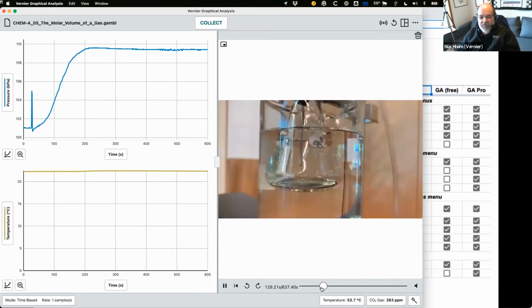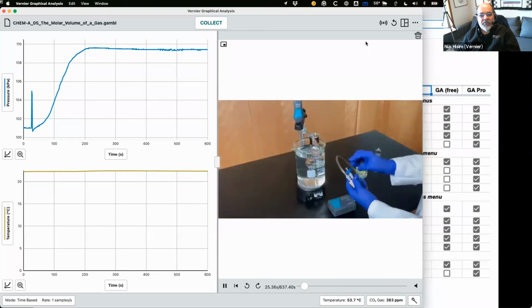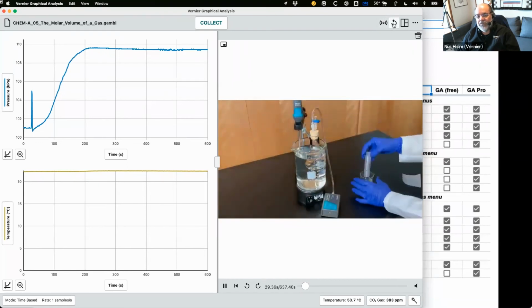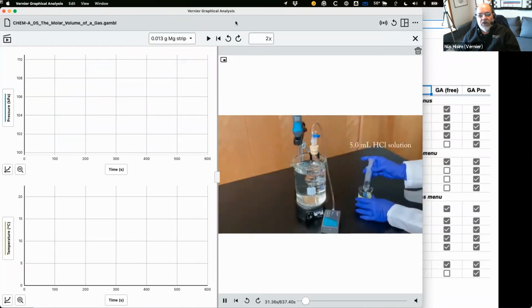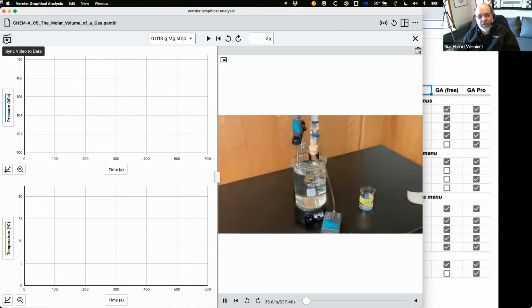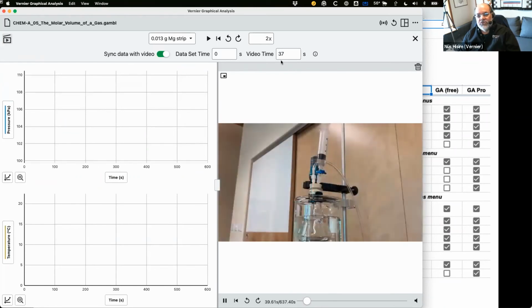In this particular file, I believe she did that for us. If you tap up here on this little curly Q next to the TIE fighter, you can then also, over here, with this little Hollywood clapboard sort of thing, synchronize your data to the point in the video where the data actually starts getting collected.